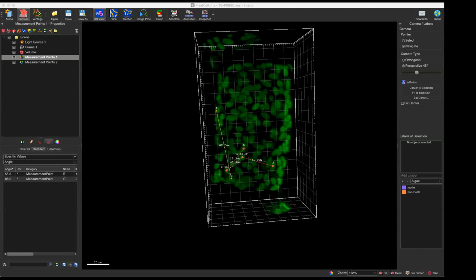So what can Spots do? From this image, I want to give you a brief concept of what Spots can do. On the left is a cell with some proteins, maybe. Let's say you want to count the number of these green proteins, then it is probably good to use Spots.